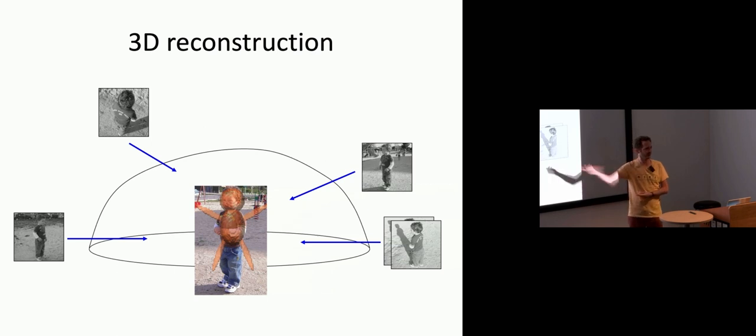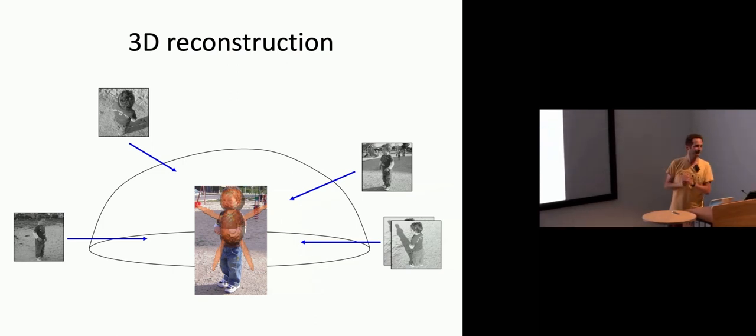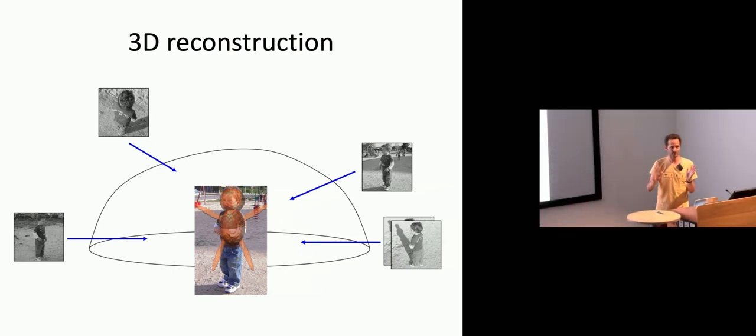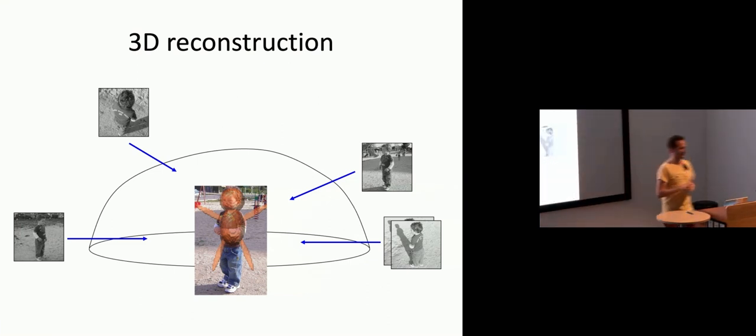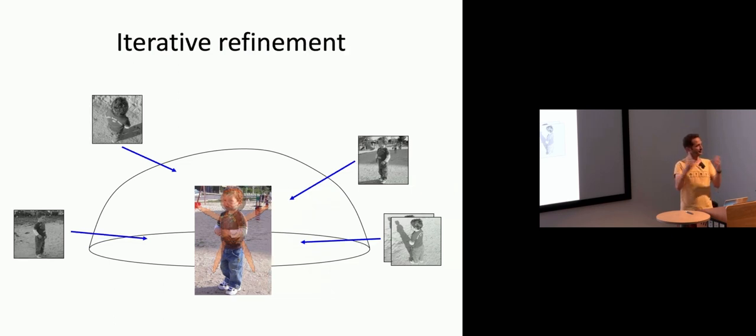And it's a nasty thing because this is now a reconstruction made just from Jan's images, but somehow there's a bit of history of what I've done with my image processing still present in this map. And this happens to your own reconstructions too. Now, fortunately, hopefully this one is better than the original puppet of Jan, not guaranteed, but it is very often the case. Then I can repeat the process. I can make projections of this Frankenstein of Jan and an orange puppet and make new angular assignments, which hopefully are slightly better, so that if I do another reconstruction, the orange puppet influence is gone.